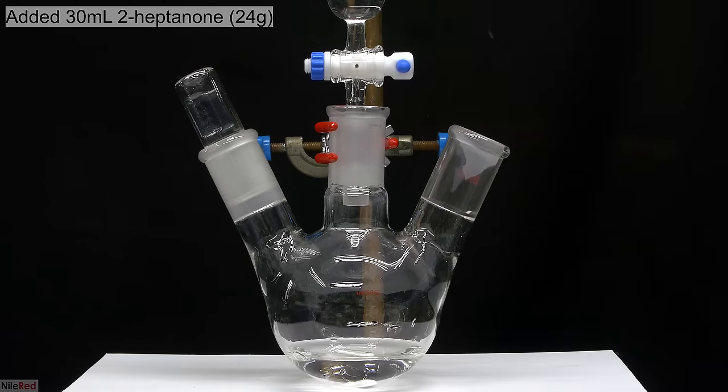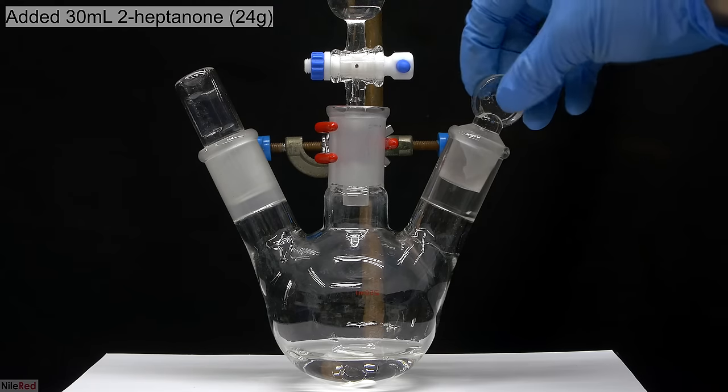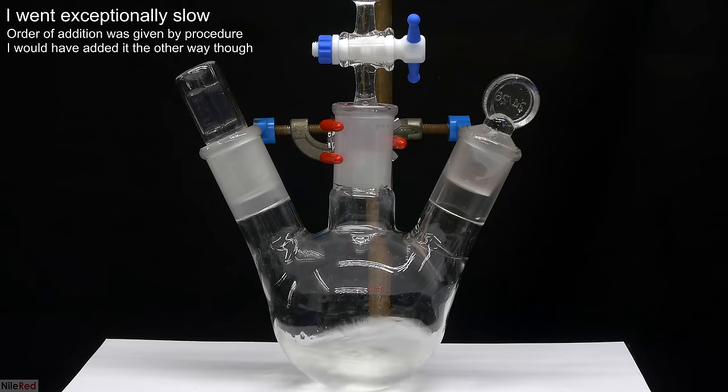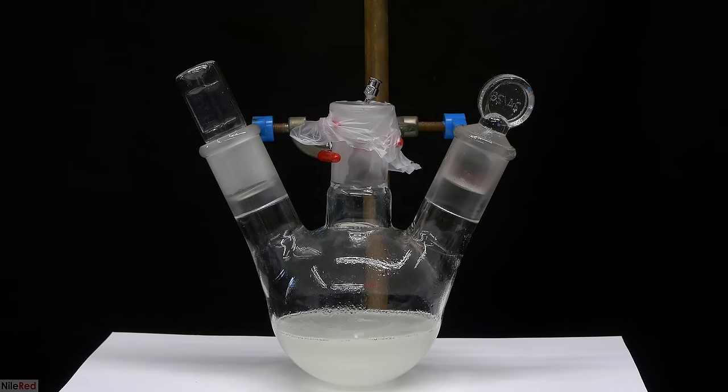After all of the 2-heptanone had been added, I stoppered the flask. I turned on some strong stirring, and then I opened the addition funnel to slowly add the solution into the 2-heptanone. I added everything over the course of something like 30 minutes to an hour, but I probably could have added it much quicker. Once everything had been added, the addition funnel was removed, and things were allowed to stir for about 5 hours.